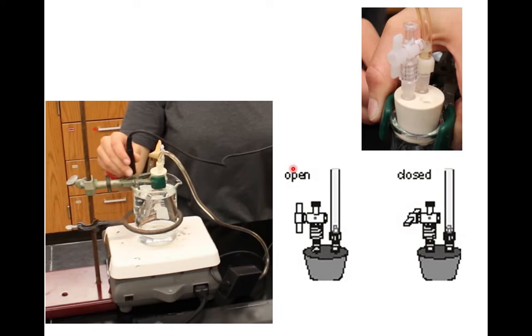All right, your specific experimental setup that you're going to have today. Here's the setup. You want to have the ring stand. This is to prevent this beaker from tipping over. We have boiling water in here, so we do have a scalding hazard, and so we've put this around here to keep this all stable. We use the arm that we add on to our ring stand in order to clamp down the flask, because this is full of a gas, and so it's going to want to float. We use this to force it down in there. And then finally, the temperature probe can just rest, after we set this up, down in the crease in this arm. And so your setup should look something like this today.